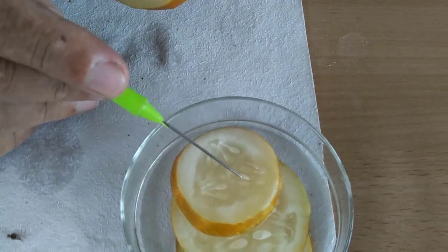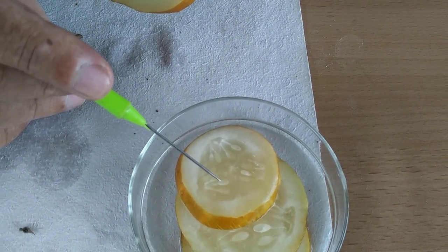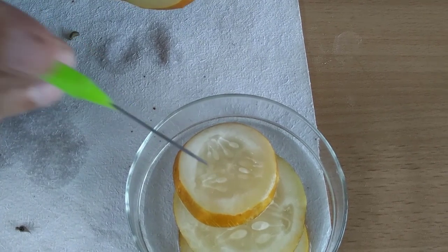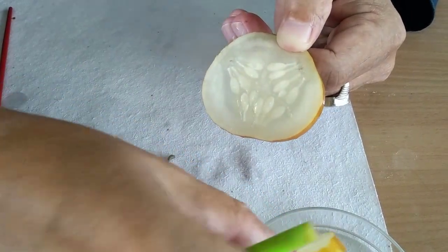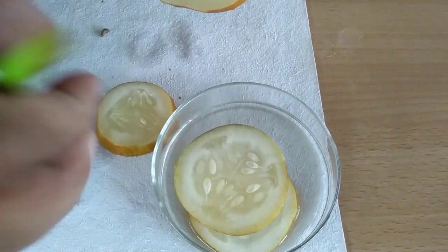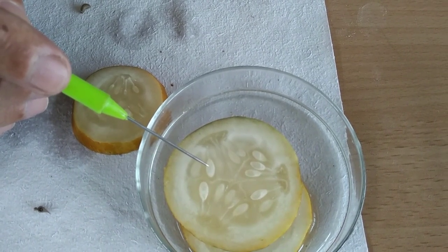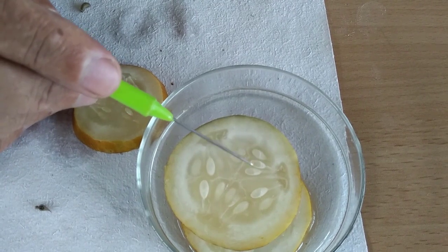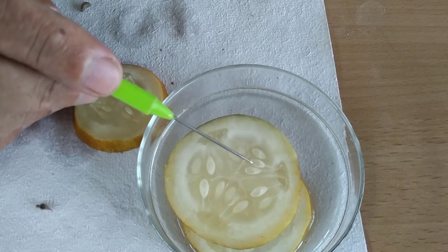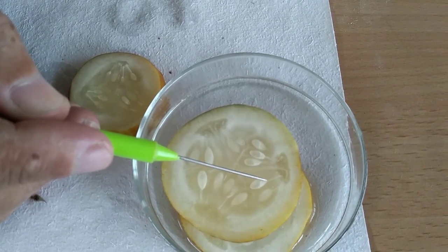If you have very young seeds, do not take them. Itne chote chote seeds mat lijega — from such small seeds you will not be able to extract the endosperm properly. The seed should be mature, the seeds should be large. Now look at this — this particular seed is beautiful, you will get good endosperm from here. But from both of those seeds you will not get good endosperm.